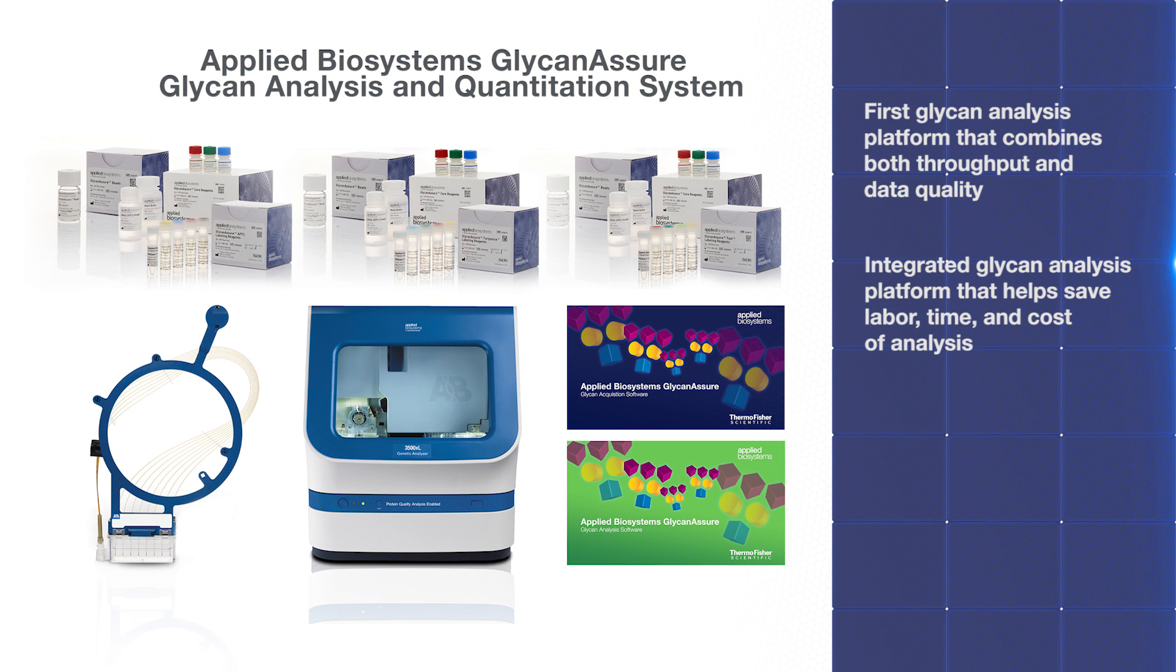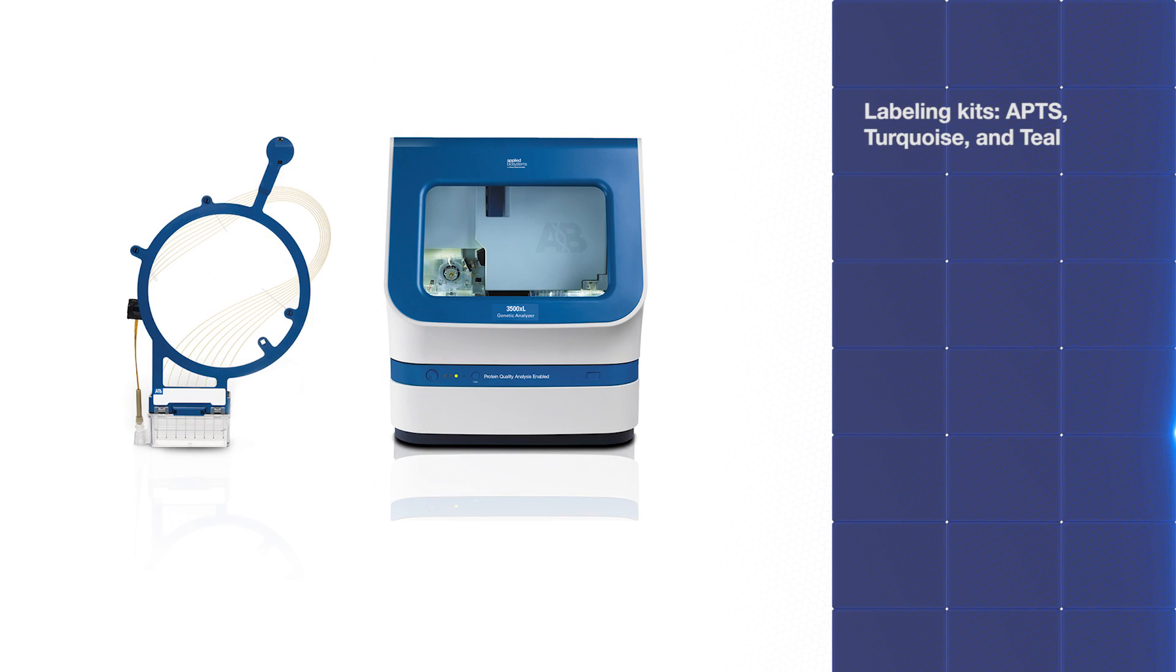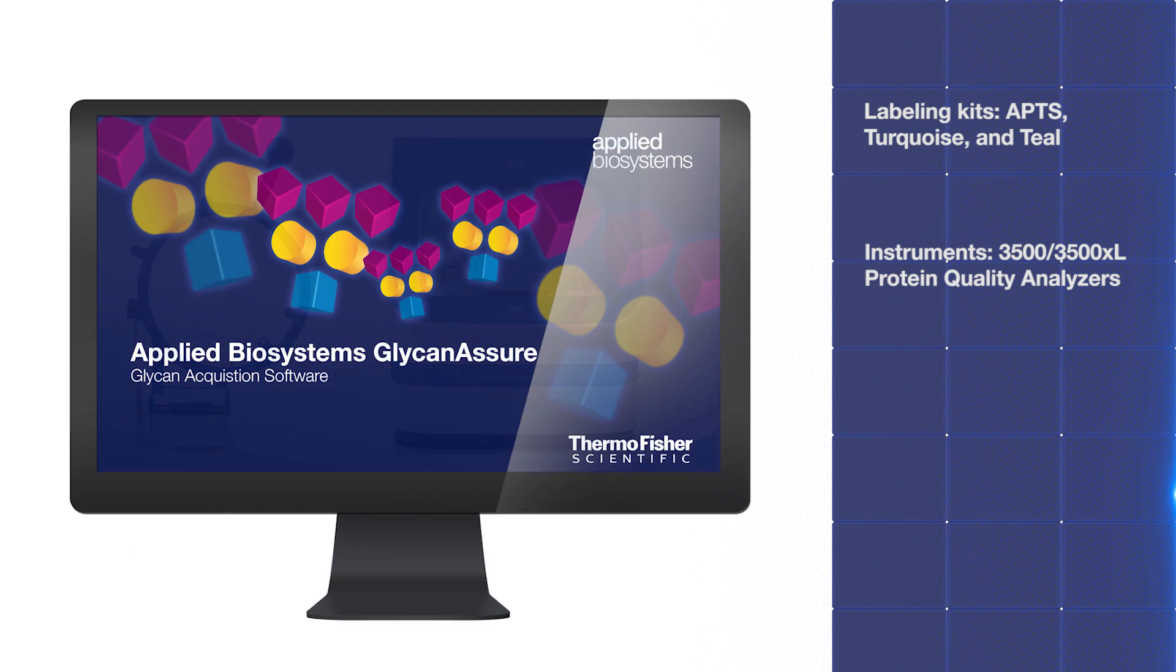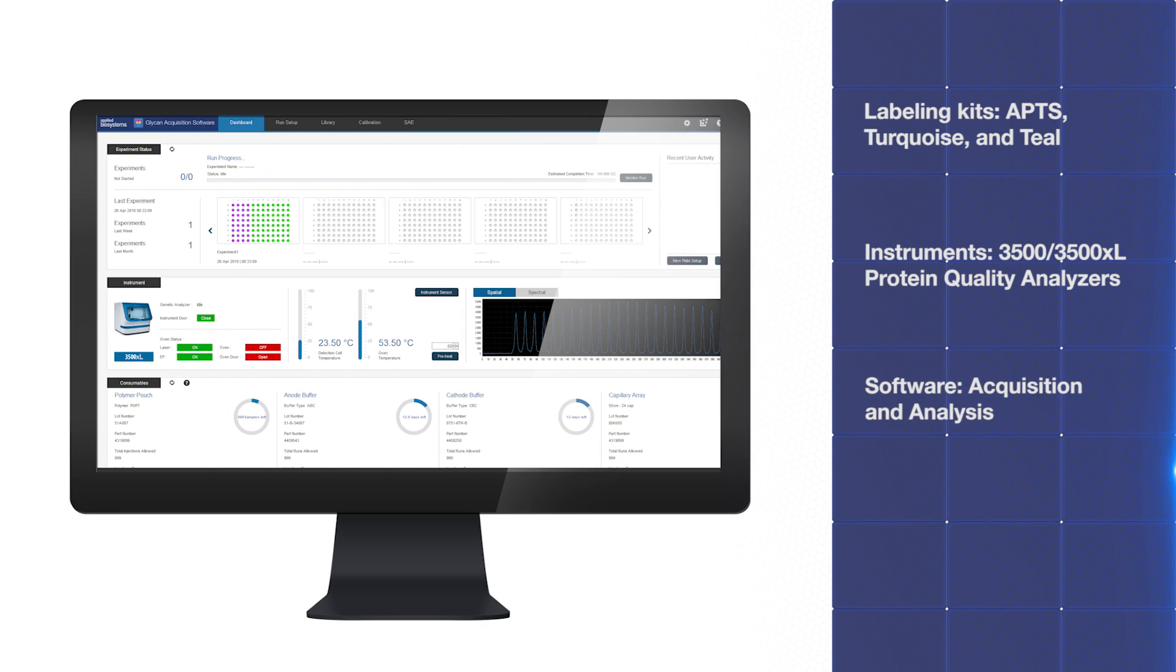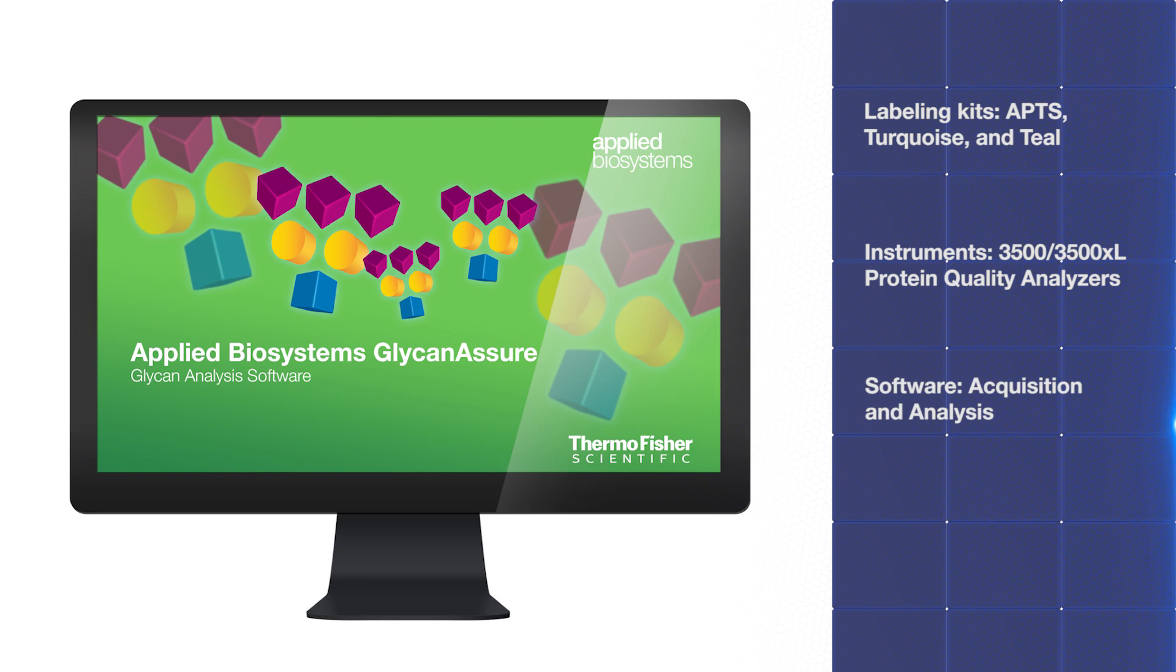The Glycan Assure system offers simple magnetic bead-based sample preparation with multiple glycan labeling fluorescent dyes for superior sensitivity and selectivity, multi-capillary CE instruments for high-throughput glycan analysis, and assay-specific software for fast data analysis and reporting.